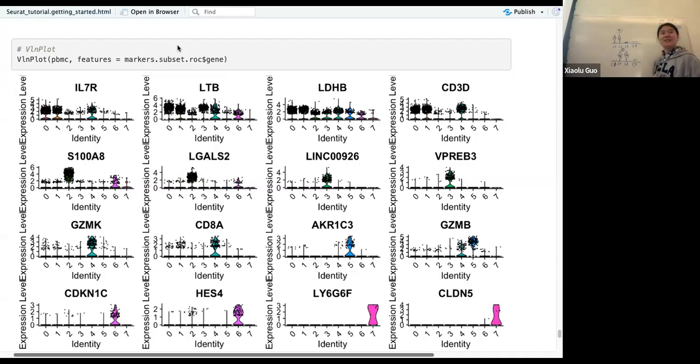Can we separate C1, C2, and C3? Yes, actually it can distinguish these three if you analyze them properly.